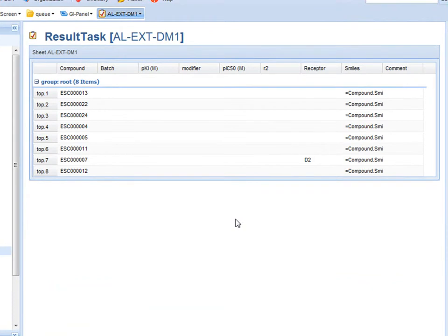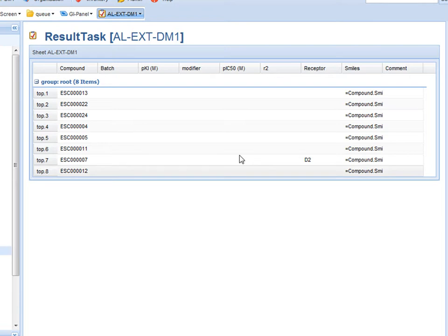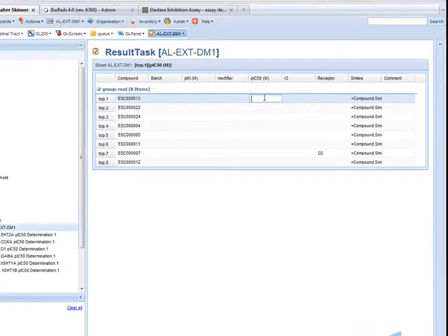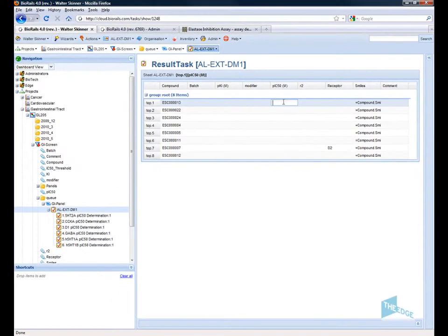Or another electronic lab notebook, or another data management system. BioRails provides an open access method for getting data from external systems back into the BioRails request system. In this case I am just going to manually fill them in.